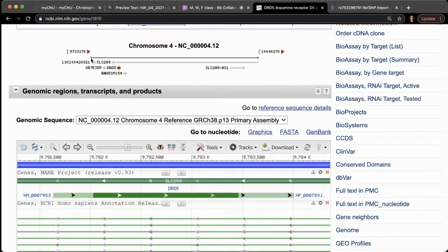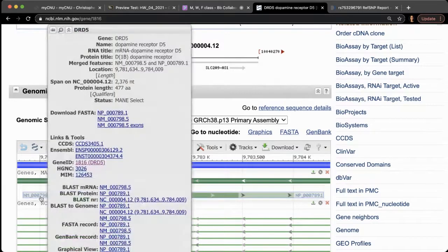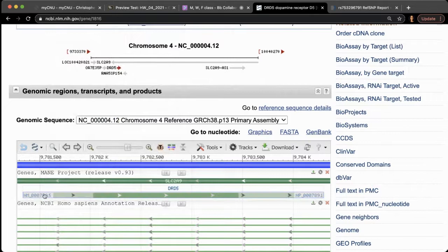If you think about these as one street and these are house numbers, then maybe this is a boulevard, okay? You can either drive in one direction on the boulevard, or in the other direction. So we are driving in the direction of the boulevard where the numbers are going up, okay?